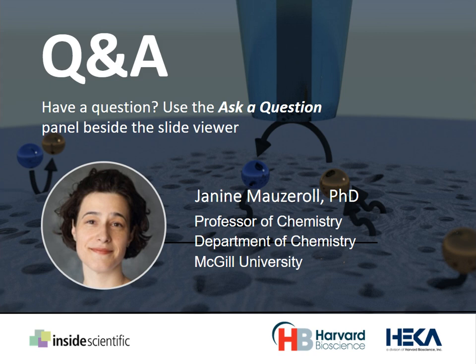So the first question here, what are the similarities to SVET? So I think that's scanning vibrating electrode technique. Yes, so SVET measures, first of all, it's oscillating, right?